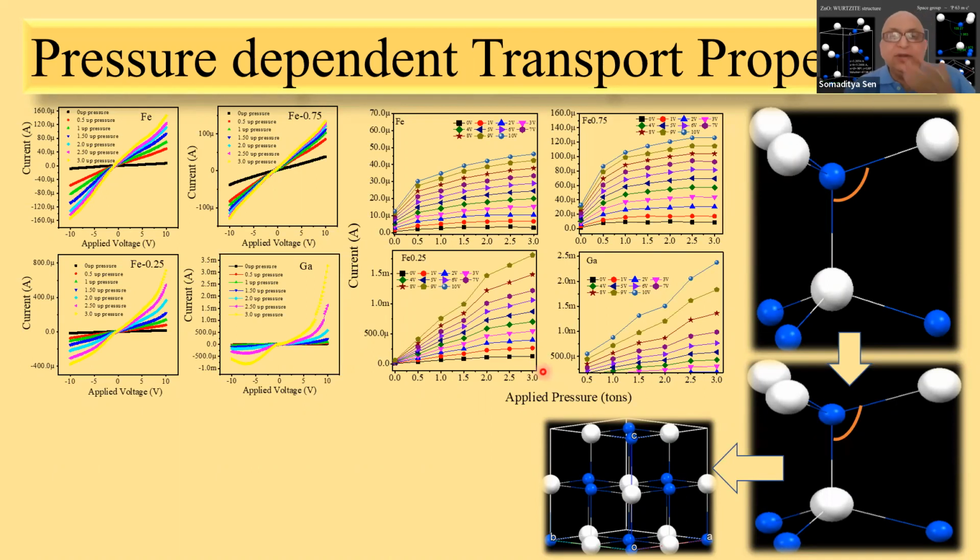Okay, so what you have done, the best way to look into the changes is to do a normal current versus voltage measurement to see whether the electron's mobility factor or what is changing actually. See, we cannot change the carrier concentration here. So the only change that can be done is how easily or how more difficult the electron can get a chance to be transported. Okay, that's a mobility factor. So the chance of hopping from one side to another, how much easier or difficult it is.